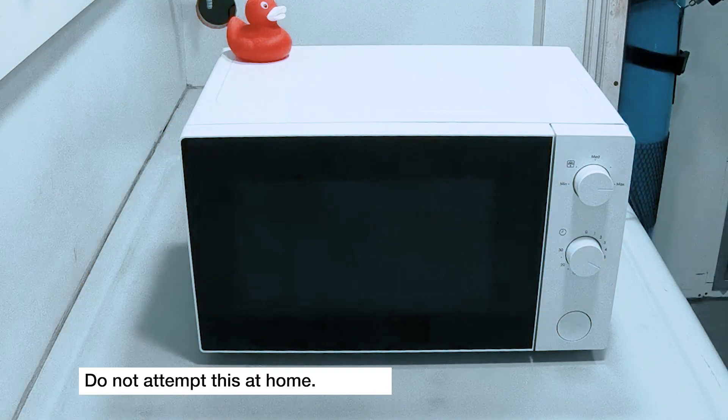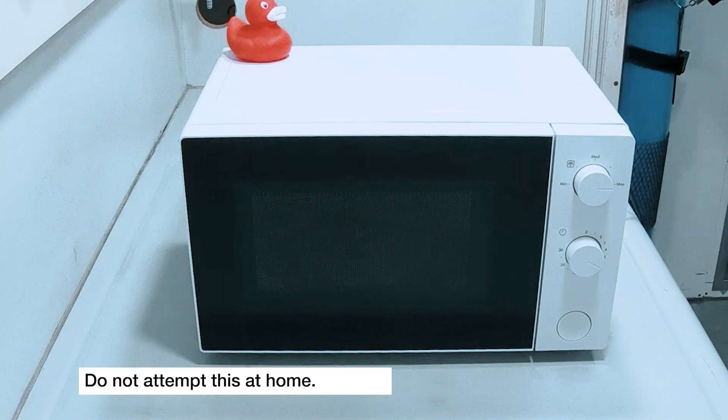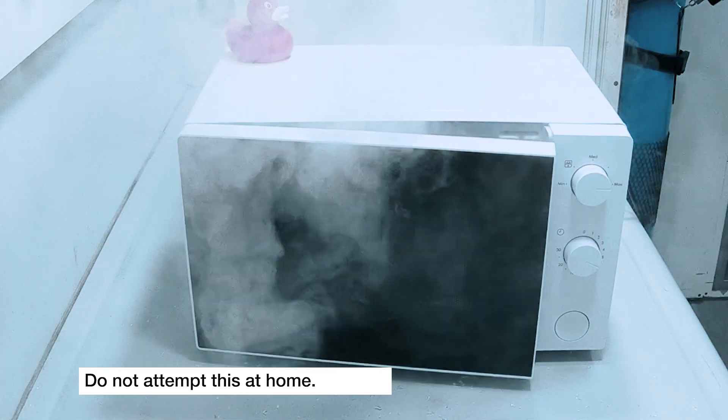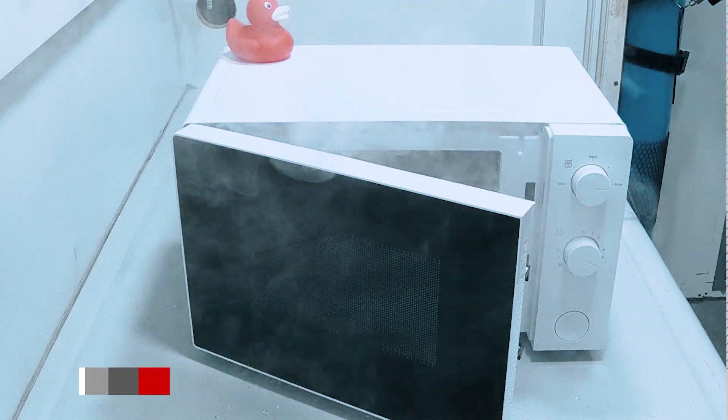In a kitchen microwave with no pressure control, the container will quickly explode. We don't want that happening in the lab. Hot, poisonous acid fumes would be released.